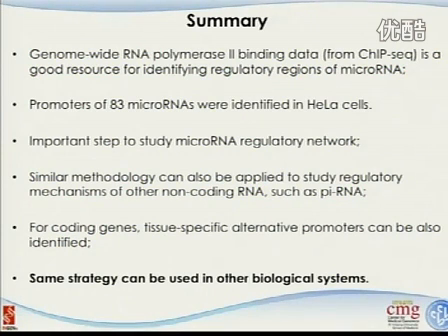Okay, the reason I think, throughout this course, this is the first time I'm talking about my own research, and I always talk about others. And the reason for this is, you see a ChIP-seq experiment. If you go outside to talk to other people, most people just tell you about the peak finders, and they assume that is ChIP-seq. Right? That is not. That is one part of a ChIP-seq experiment, and many different groups have already studied that with many different algorithms.